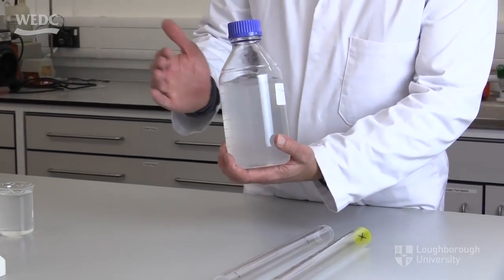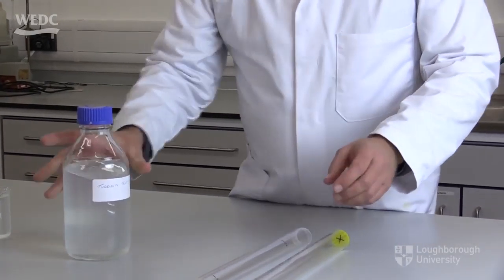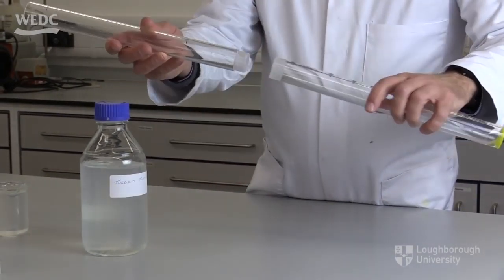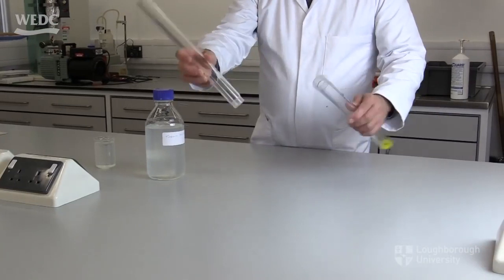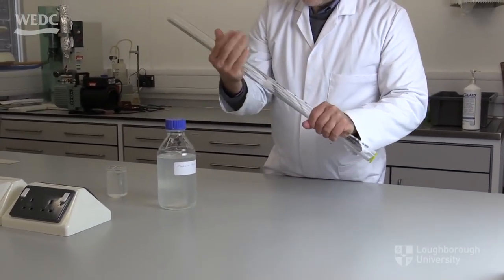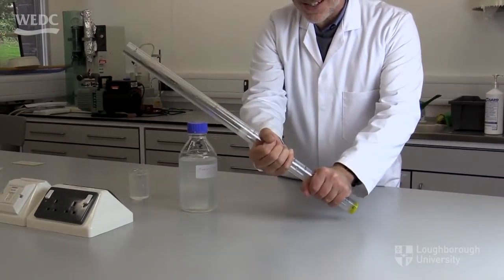We have some fairly dirty water here, but we don't know how dirty or turbid it actually is. We'll look at the first means of measuring turbidity using a conventional turbidity tube. This is what a turbidity tube is: a long, thin, transparent tube made of two parts that fit together so that it is easy to carry.